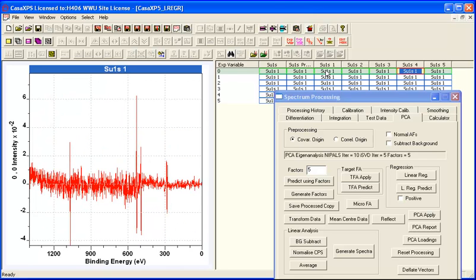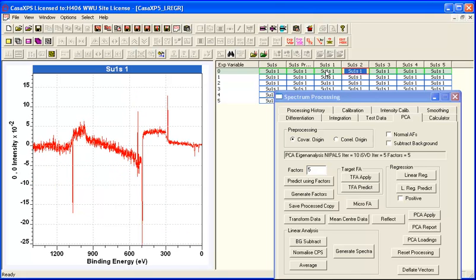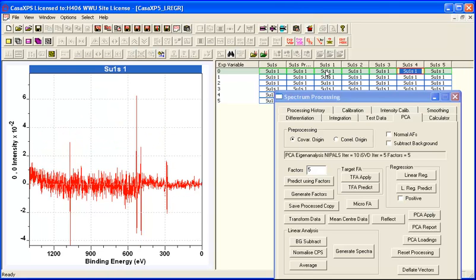So what we have are a set of abstract factors that look like we've got a significant shape, and then a difference to that significant shape, again a third difference, so we'd expect to find 3 significant differences between these spectra, and then that one looks like we may have a little bit of a shift.